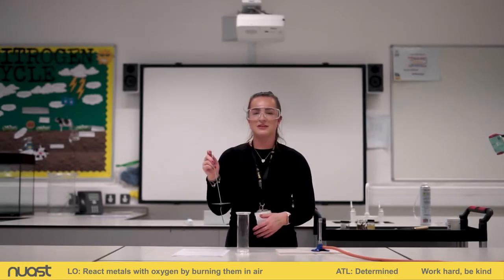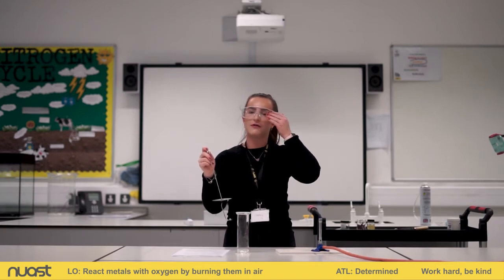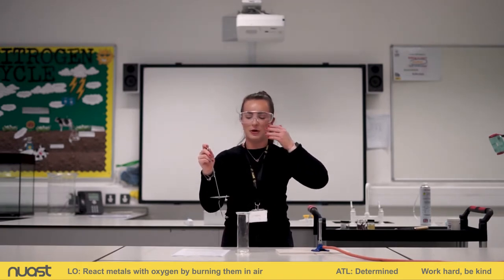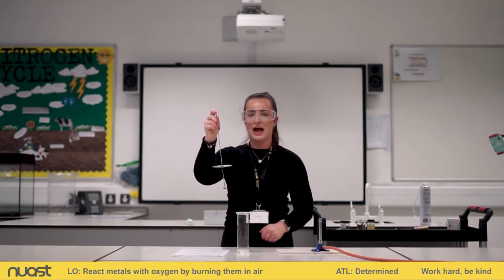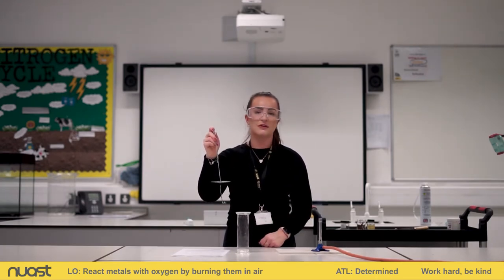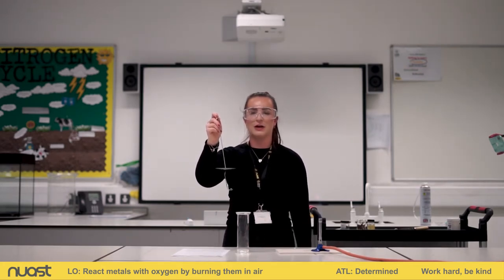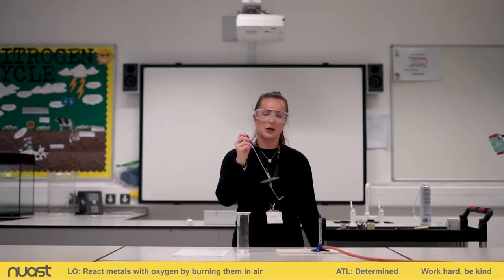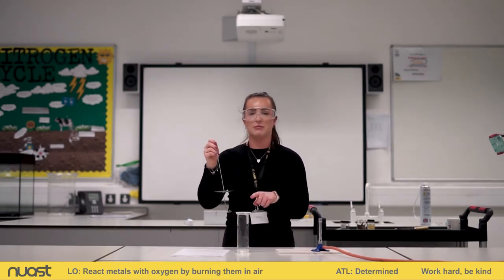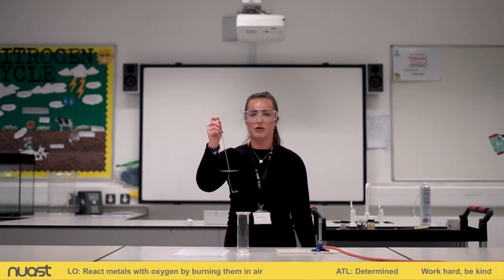If we were in school today, when we were looking at this demonstration, I would have told you to put your hand over your eyes with them slightly open, because looking at the magnesium burning can actually damage your eyes slightly. Absolutely fine to watch through the camera and through your screen, but I won't be looking at it directly because it can damage your eyes. So let's get going. I'm going to put it straight into the Bunsen burner, then quickly put it into the oxygen, and make sure you're looking really closely at which one is brighter.